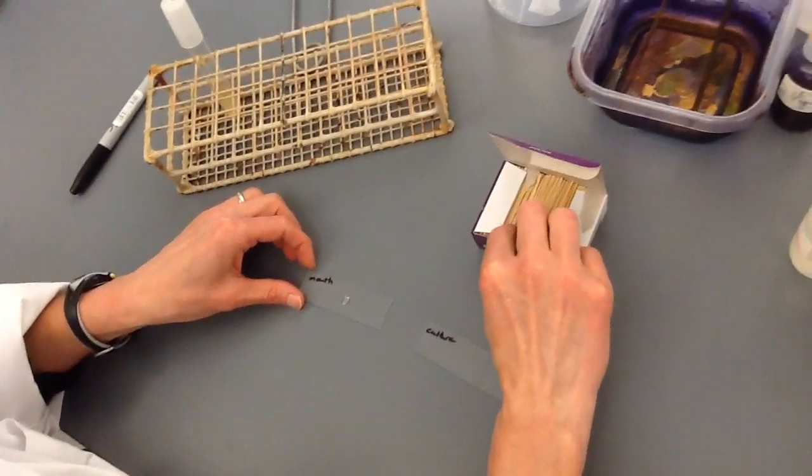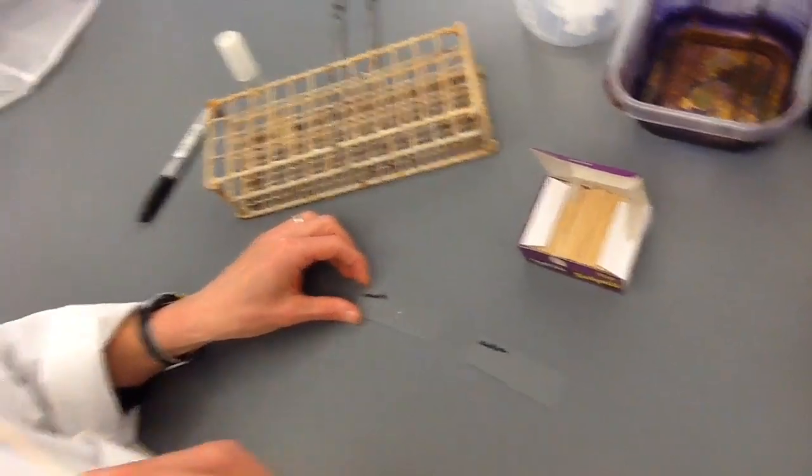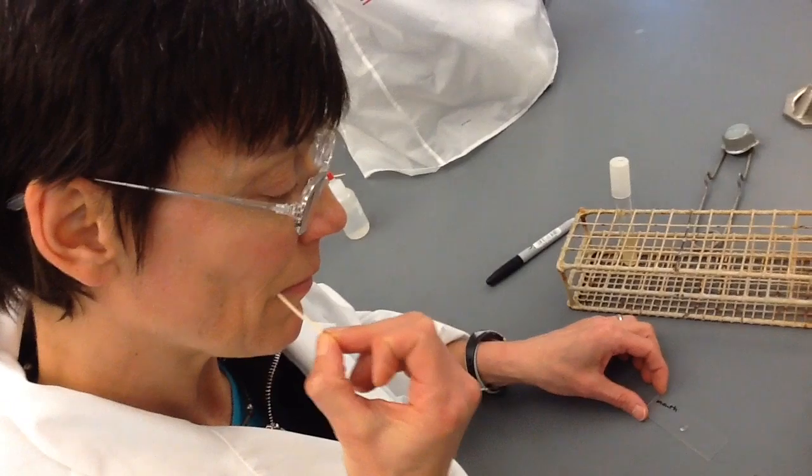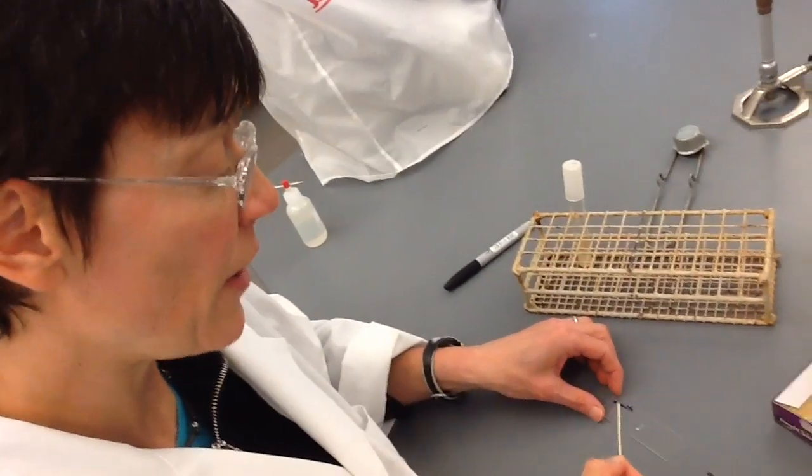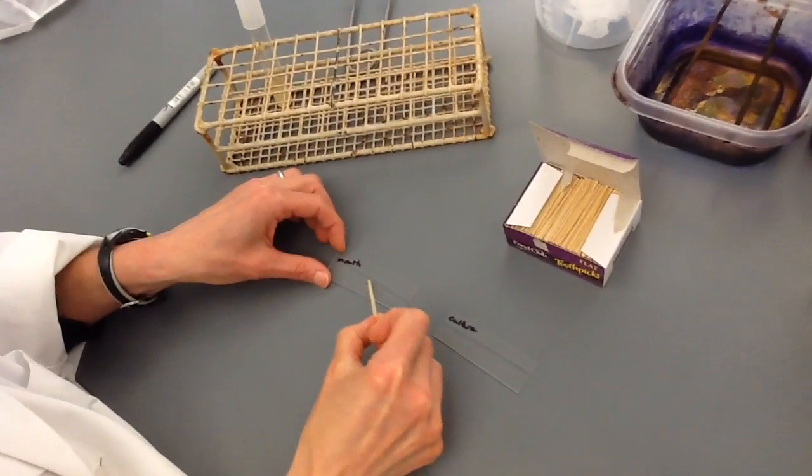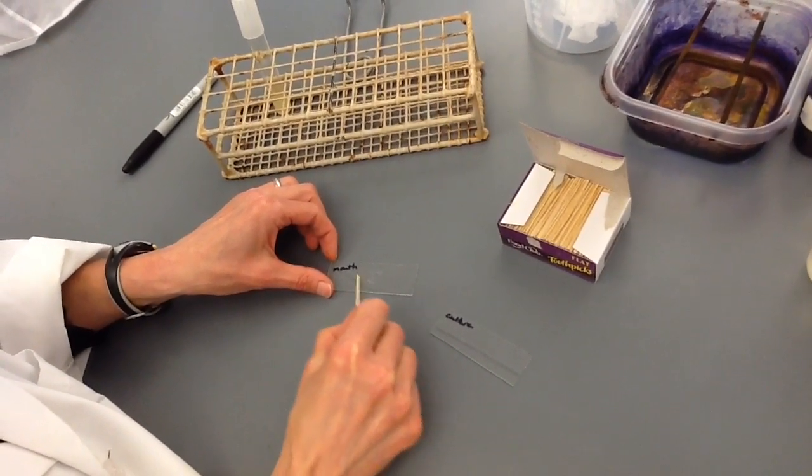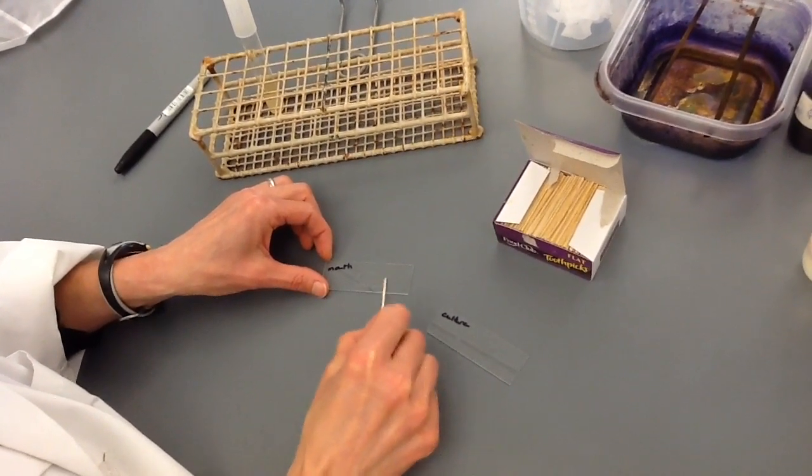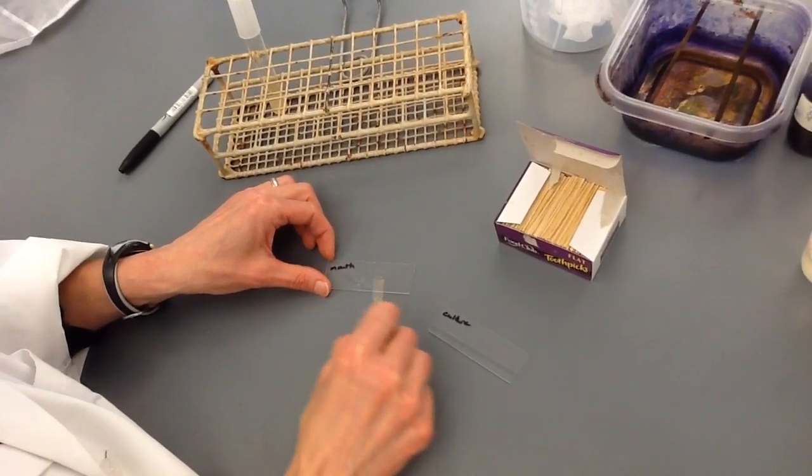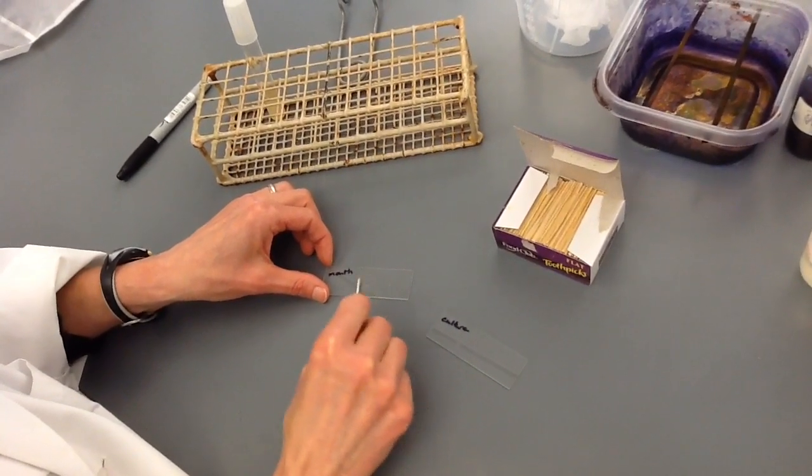Then you take a toothpick and you actually scrape along the gum line of your mouth and mix the sample in using the toothpick to spread the sample across the slide to the extent possible so that it doesn't take too long to dry.